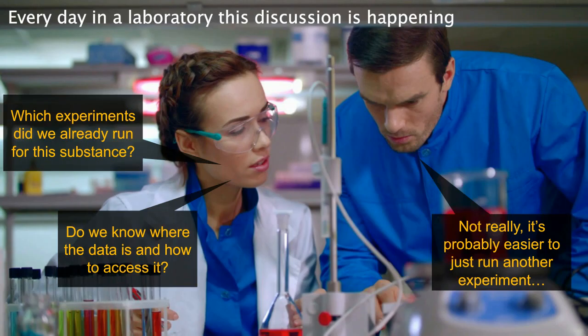This is a slide we put together because I think a lot of people who've looked at labs will agree that every day in laboratories, this kind of discussion happens where someone says, well, what experiments did we already run on this substance, and do we know where the data is, and can we access it? And someone says, not really. It's probably easier to just run another experiment. That can get quite expensive, and you're just producing more and more data that's duplicated with stuff you already had because you simply couldn't find it in the first place.